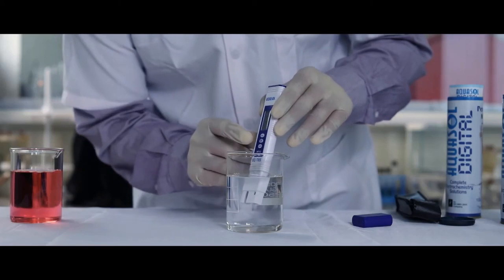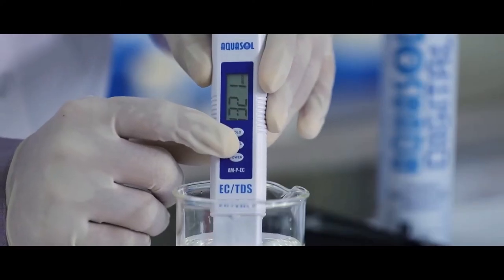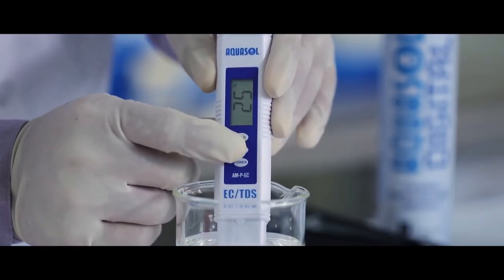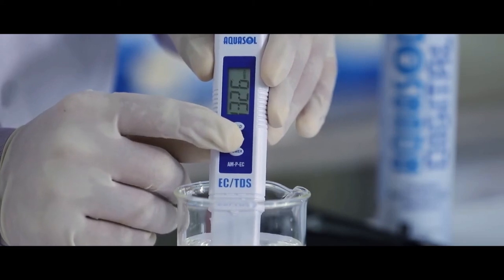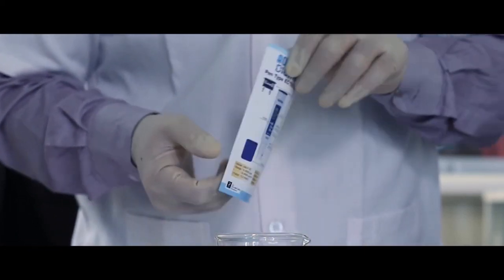we can measure the conductivity of the sample. Dip the electrode in the sample and stir gently. Press the hold key to note down the reading. Please refer to the impact leaflet provided.